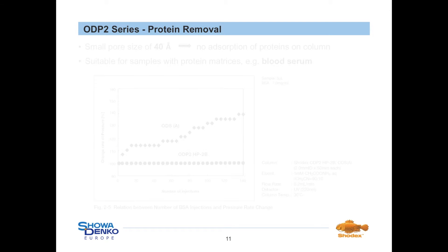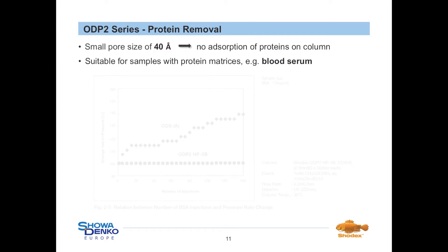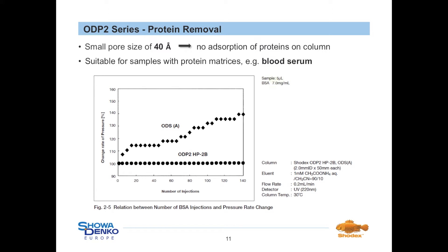Moreover, the ODP2 series has small pore sizes of 40 Ångström, making it suitable for protein removal. Samples with protein matrices, for example blood serum, can be directly injected without time-consuming sample pre-treatment. As a proof of suitability, a sample containing BSA, a protein of 60,000 Dalton, was injected into two new columns, ODP2 HP-2B and ODS-A. In the case of ODS-A, multi-layer adsorption of the protein was observed over 140 consecutive injections, resulting in significantly higher column back pressure, requiring column exchange. In the case of our ODP2 HP-2B column, back pressure was quite stable over 140 injections, showing that no adsorption is taking place on the polymeric material.